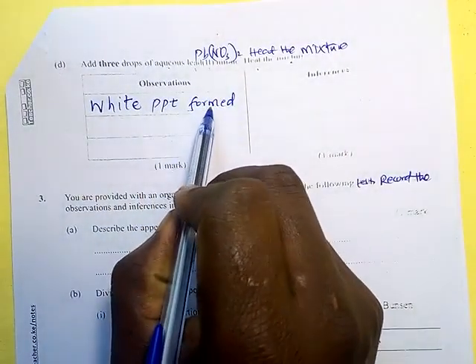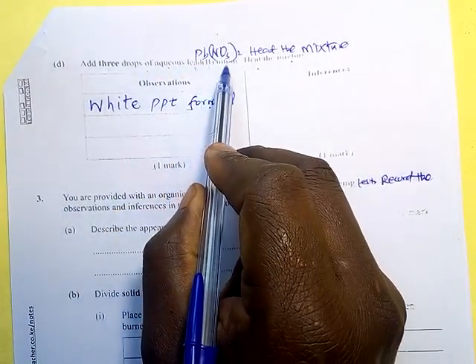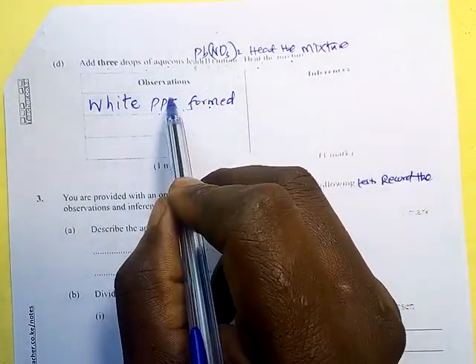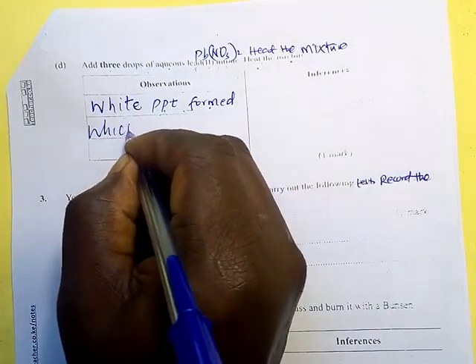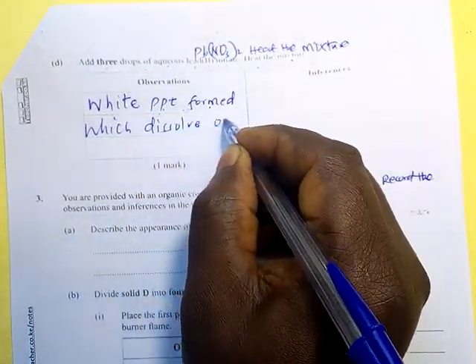The observation we have made is for adding lead nitrate. After heating, what happened? Did the white precipitate dissolve on heating or did it not? That is the second observation. A white precipitate is formed which dissolves on heating.